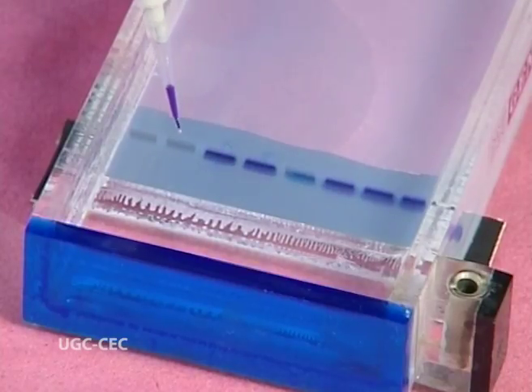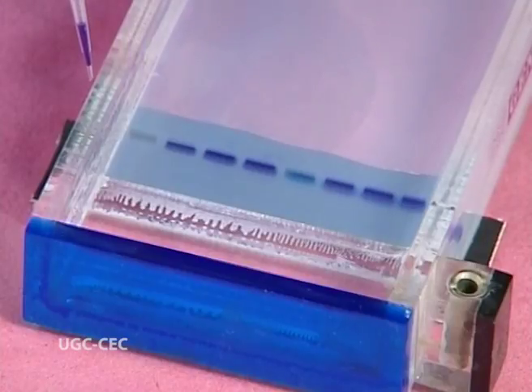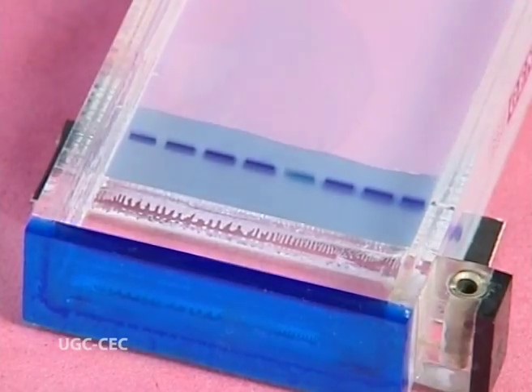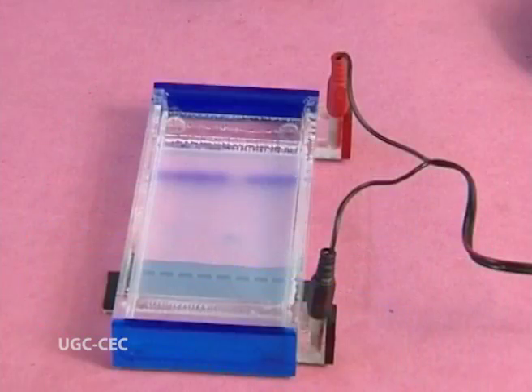When we are loading, the first 3 samples are DNA samples. The fourth one is a 100 base pair ladder, and it is already mixed with BPB and hence it is blue in appearance. The other 4 are PCR products, from which the last one is a multiplex.